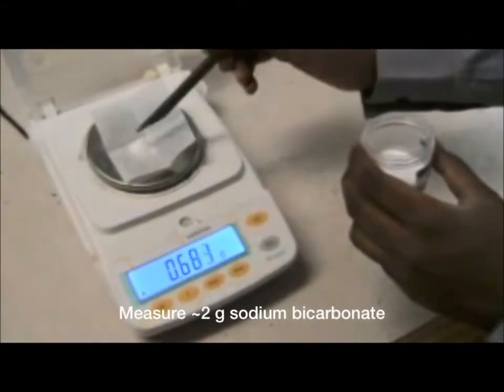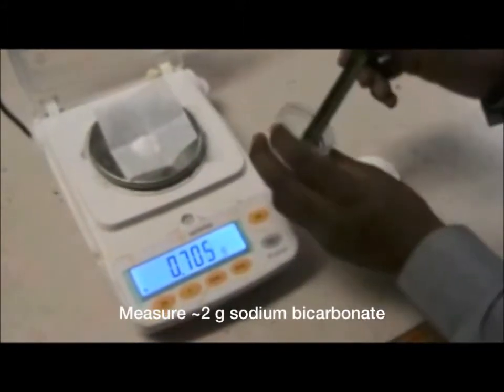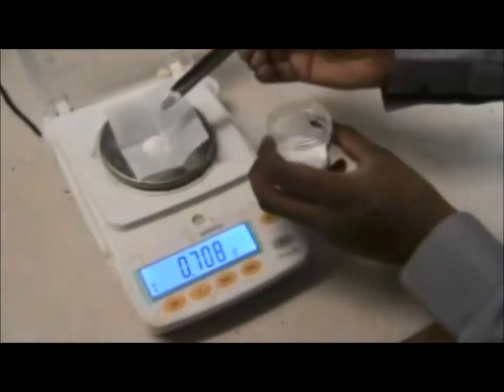After obtaining all the materials, the first step is to measure out about 2 grams of sodium hydrogen carbonate and record the mass.